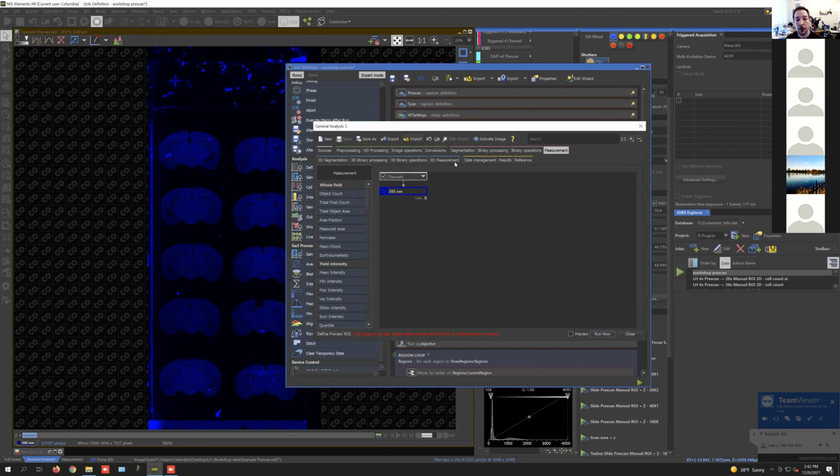So if you're planning to do something like that, I would more think about capturing the data with a job and then running a batch processing afterwards to minimize the time that you're at the microscope, reduce the cost of the experiment. And these yellow ones here are all to do with getting the data out. So making that CSV file and naming them in a sensible way. And I'm going to share some methods for doing that at the end of this workshop.